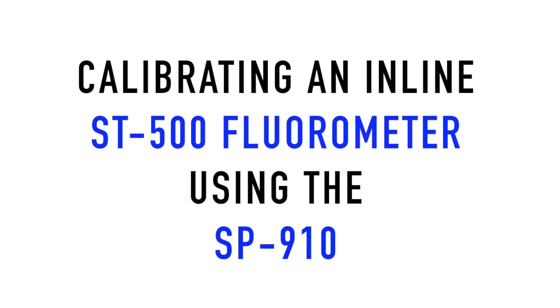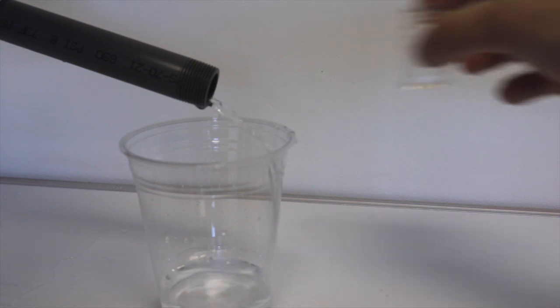This video shows how to calibrate an inline ST500 fluorometer using a Pyxis SP910. Start by collecting a system sample.